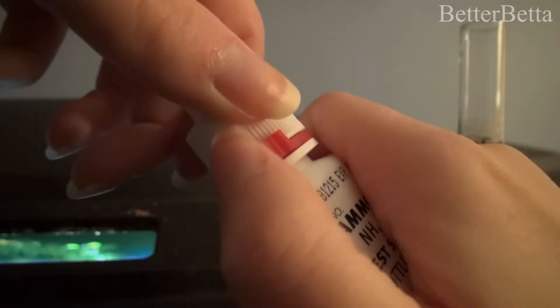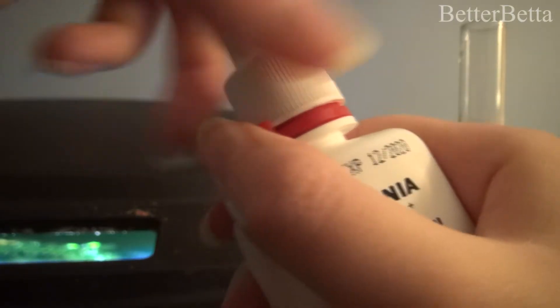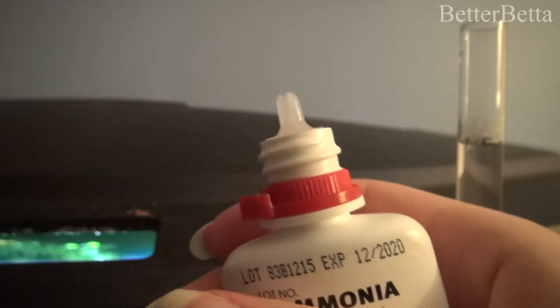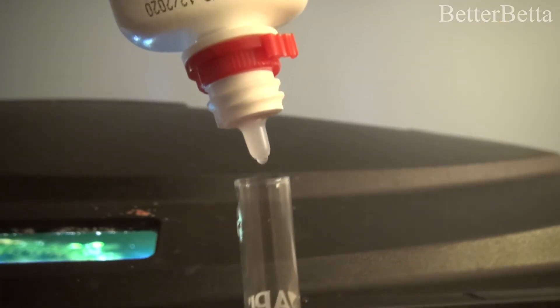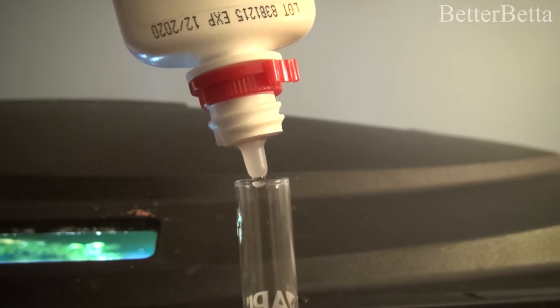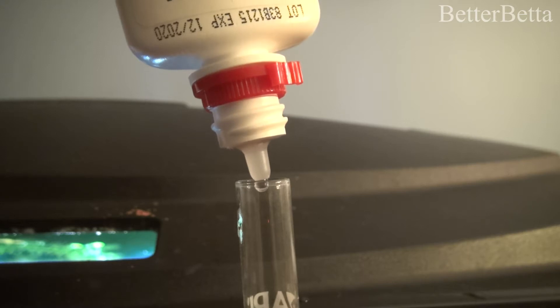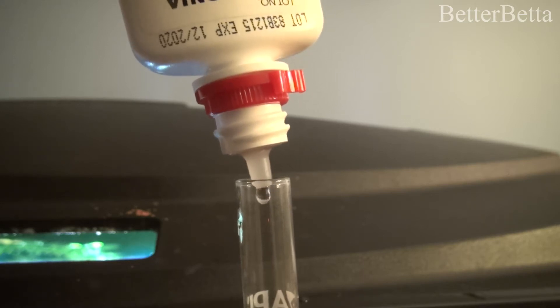The next thing that you're going to do is add eight drops of test solution number one into the vial of water. These bottles do have child-proof caps, so you're going to want to slide the little red tab to the left in order to get the cap off. When you add the eight drops of the solution to the vial, you want to make sure that you hold the bottle completely vertical so that all of your drops are uniform. If you hold the bottle at an angle, you run the risk of the drops being different sizes and getting slightly inaccurate results.